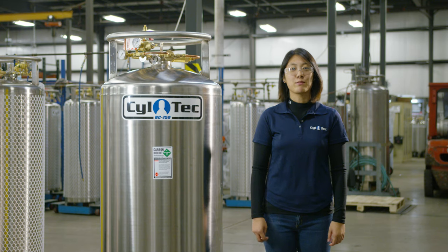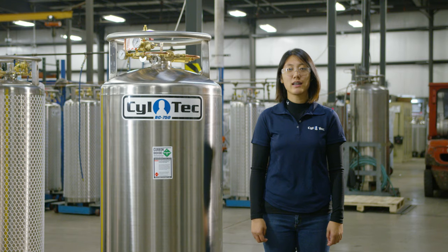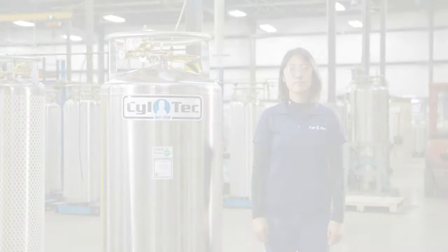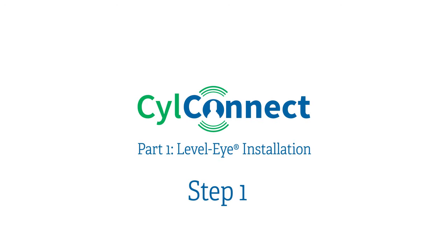Hi, my name is Ariel Choi and I'm a project engineer here at CylTec. Today I will be showing you how to install Level-Eye and CylConnect to your cryogenic liquid dewar. Part one: Level-Eye installation.